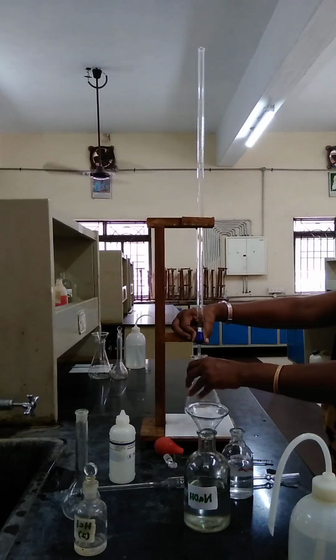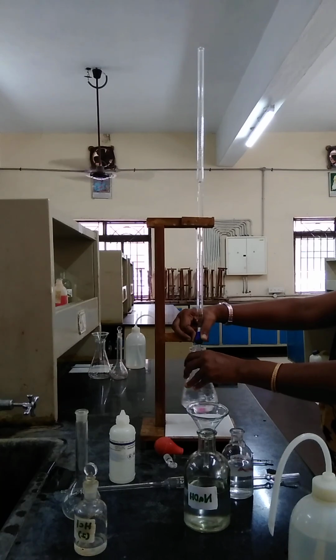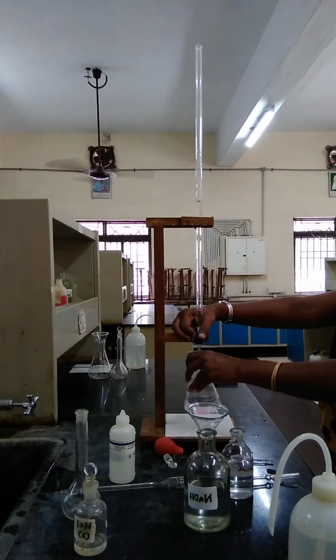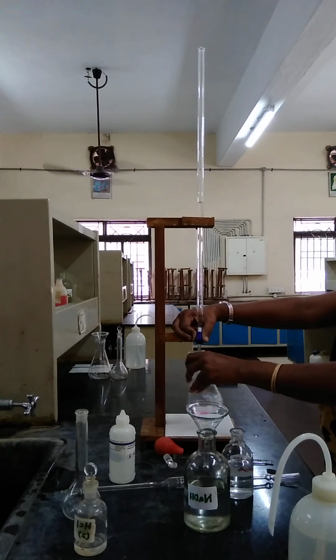If you add excess to get a dark pink, that will lead to a wrong reading. So the appearance of pink is the end point. It has to be a permanent pink. If it appears and immediately disappears, that is not the end point. The end point is the appearance of pink color, but it's supposed to be permanent. Even if you shake for a long time, it won't disappear. Once the permanent pink appears, we get the reading for the first titration.